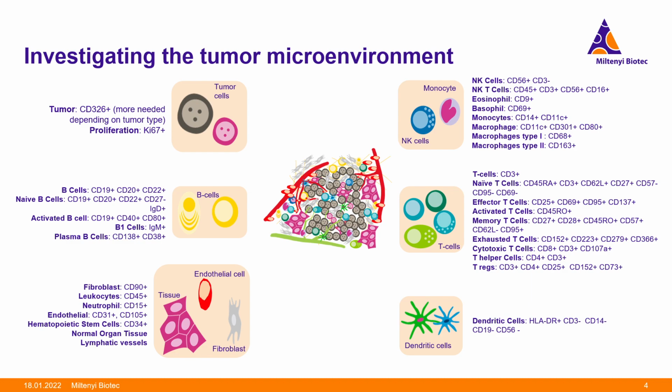It is these differences in protein abundance and localization across a macro and microscopic scale and tissue that actually may contribute to, say, the unpredictability of some cancer treatments or patient-to-patient differences. Thus, this is the need for appropriate technologies and techniques to understand the multiple facets of this tumor microenvironment.